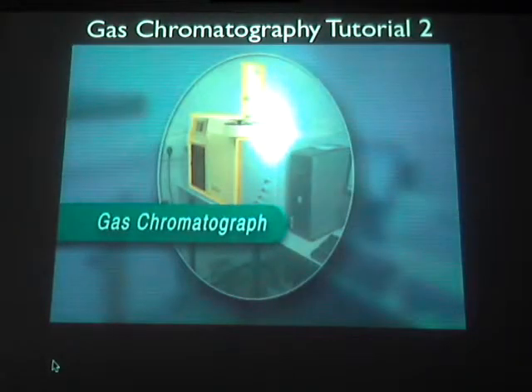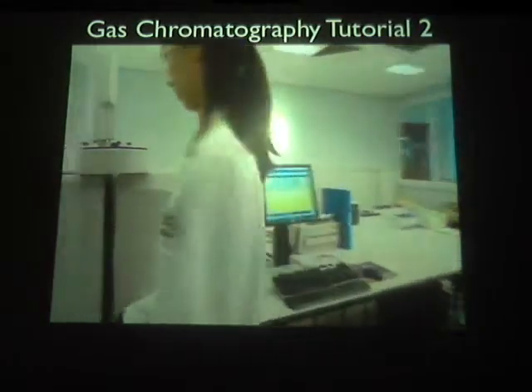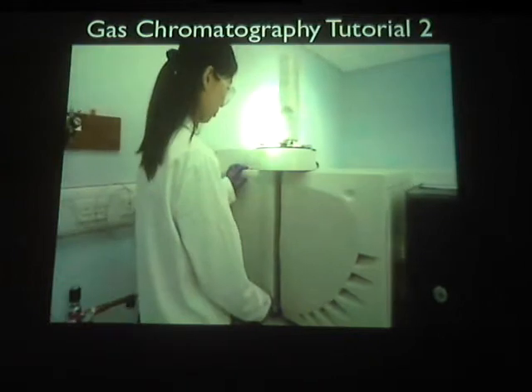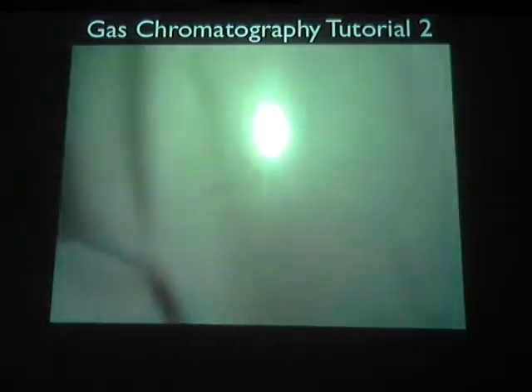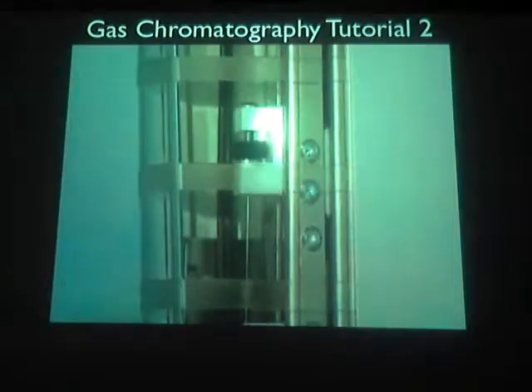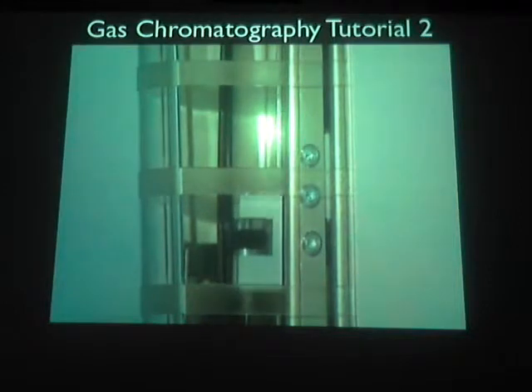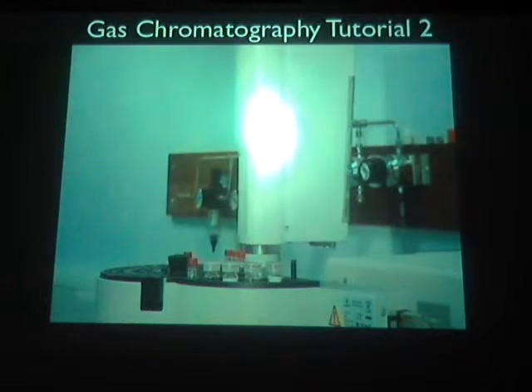The gas chromatograph is on the left, and the detector is a mass spectrometer, which runs the mass spectrum of each component as it comes out of the column. This can be particularly useful when analysing an unknown mixture, as the mass spectrum can help to identify each component. The combined technique is called gas chromatography mass spectrometry, GCMS. This GCMS instrument has an auto-changer for the samples. Many samples can be loaded up and run automatically, perhaps overnight.